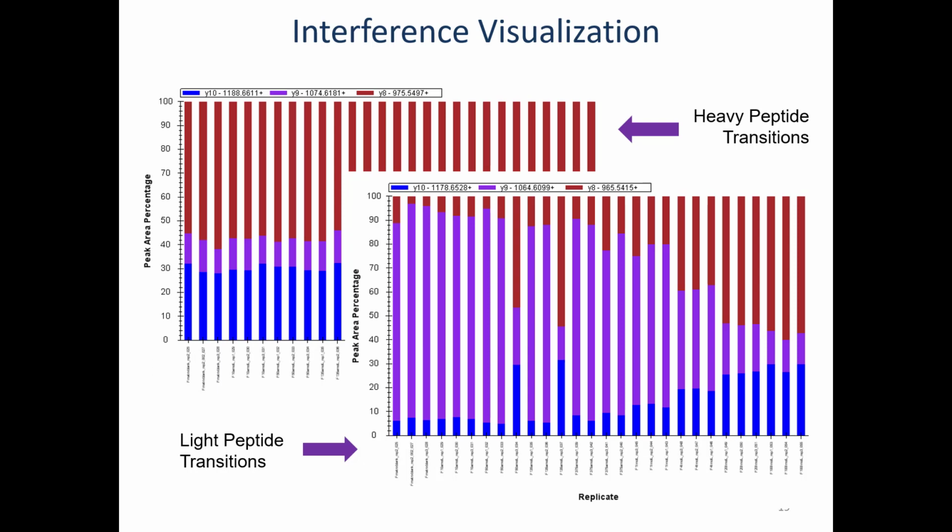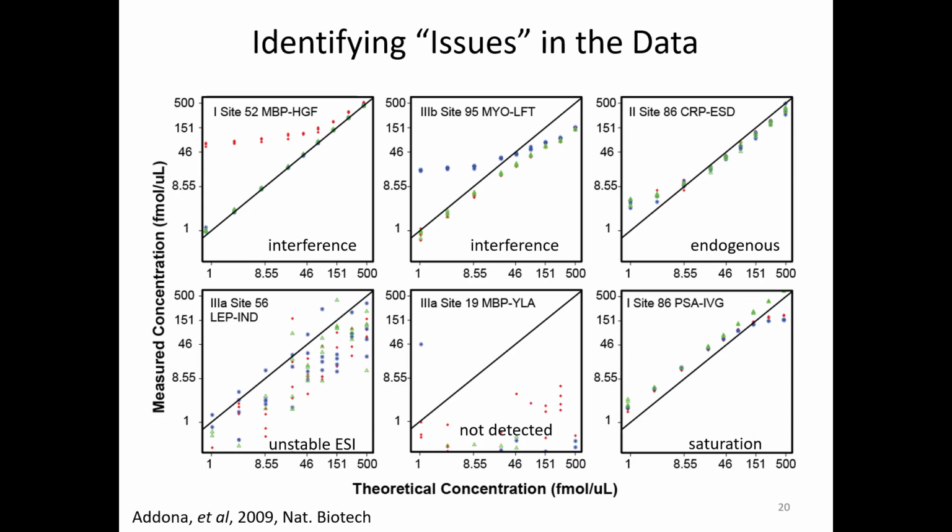Previously, we had been just looking at the peak area ratio in tables, so numbers in tables. And I black out after a while when I try to do that. So this was a nice way to visualize, like, this doesn't match this. So clearly something's going on here. And when we went in and clicked on one of these and looked, we saw this humongous purple peak that was always there in the sample, pretty much at the same level until we got to a high enough peptide level that we spiked above that. So that's something to worry about.